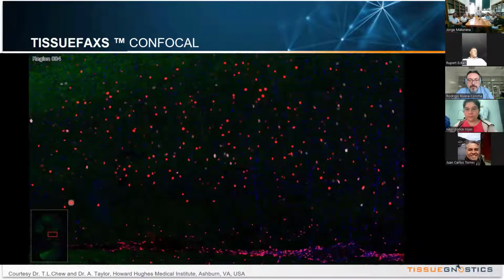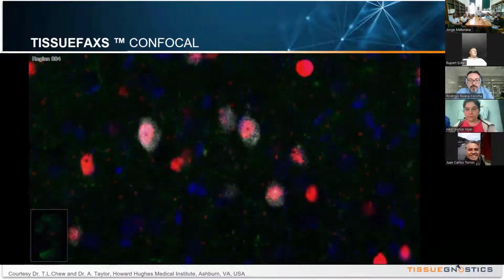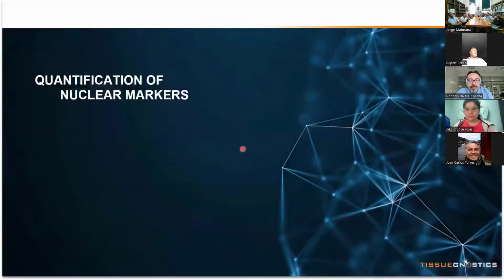Now, as I said, like with Google Earth, we can navigate through our sample and zoom in. Here, the map always shows us the overview of the entire sample. The red rectangle here indicates what is currently visible in the main window. And the more we zoom in, the more details and subcellular details become visible.